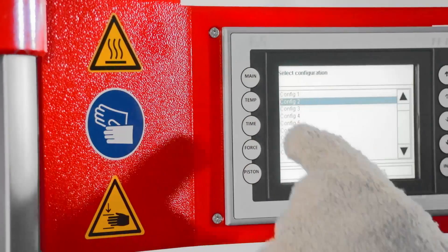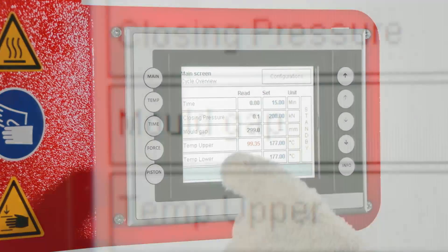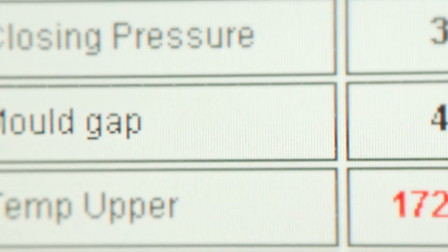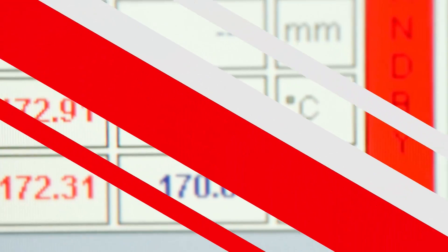Using the LP3000 is simple. It is controlled using an infrared touchscreen which can even be used while wearing gloves. The interface allows you to easily set cure configurations and can store up to 5,000 separate configurations.